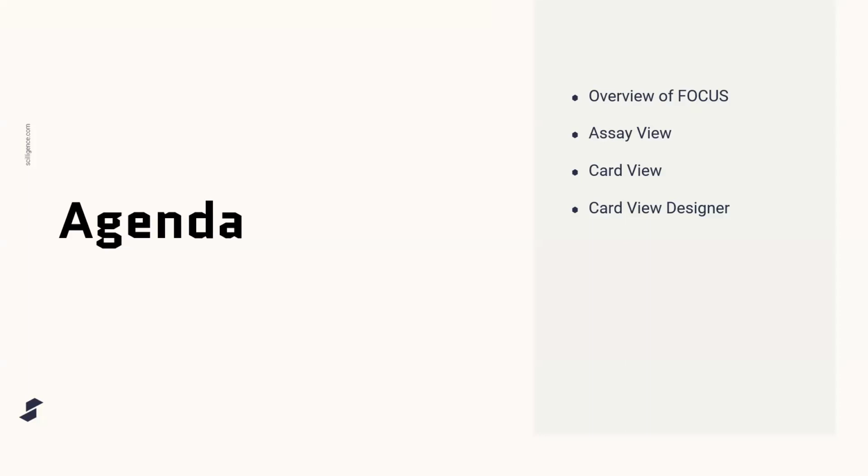And at the very end, I'll show how card views can be designed by the user themselves to be able to manipulate and view the data that they want to see. Okay, and then I'll save some time for Q&A. This one won't be as long as the Dell one, so there should be time for some questions afterwards.